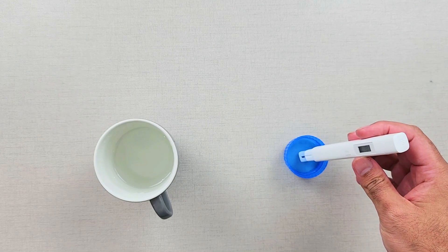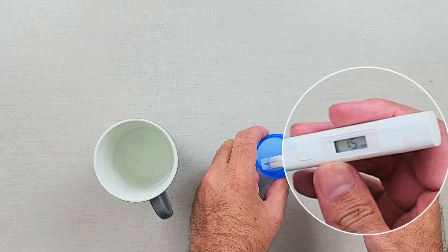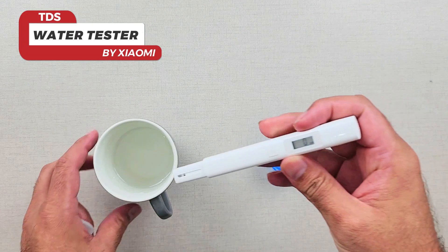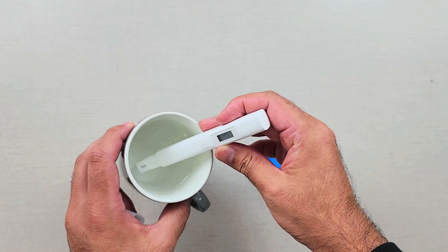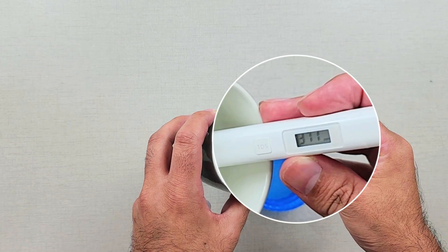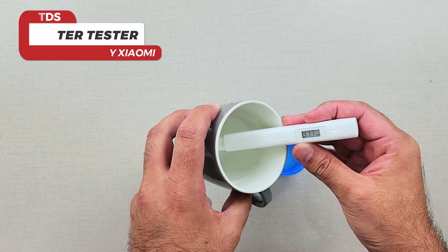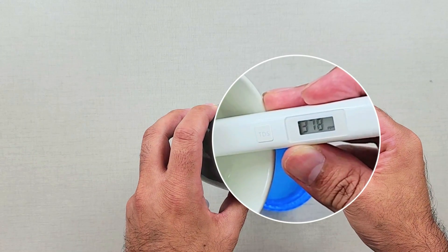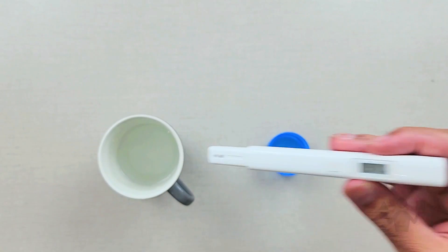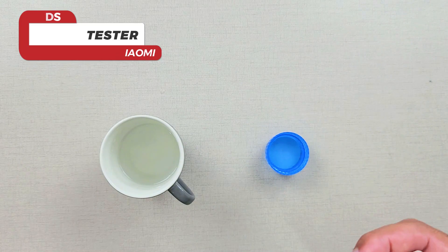Starting in the purified water, the value reads 15. Moving to the tap water, it reads around 358 to 375, stabilizing at around 370 to 380. As you can clearly see the difference between the purified and non-purified water. To be honest, even a value of 380 is really quite good.